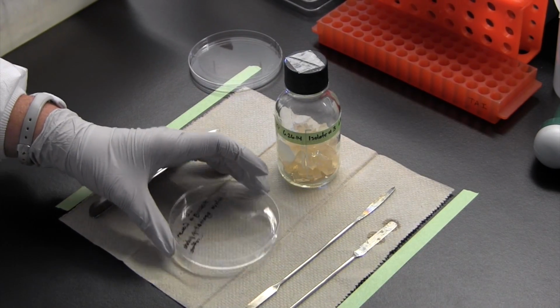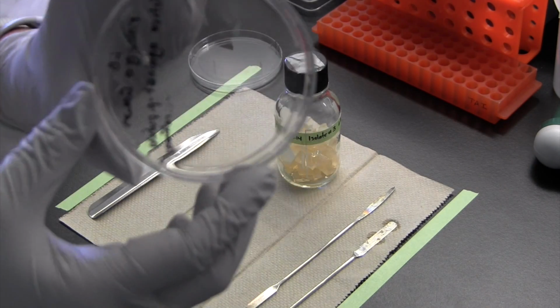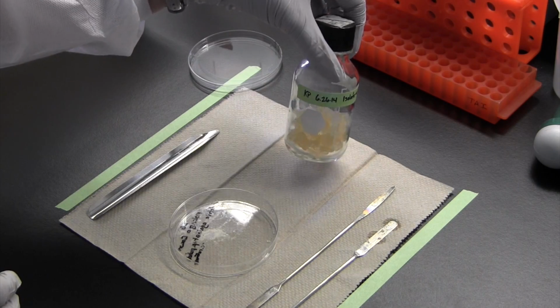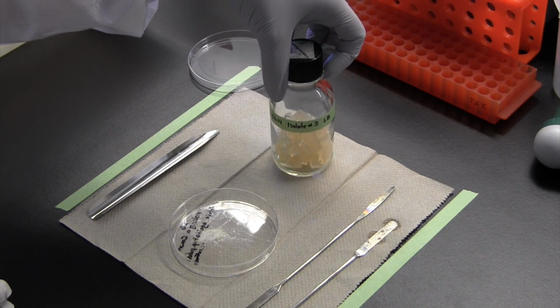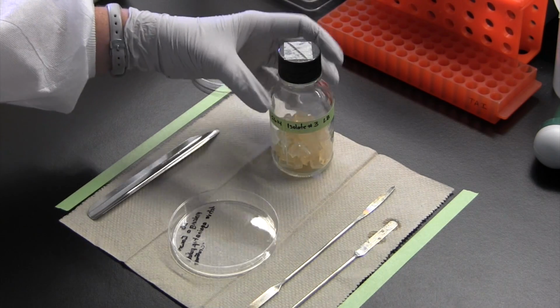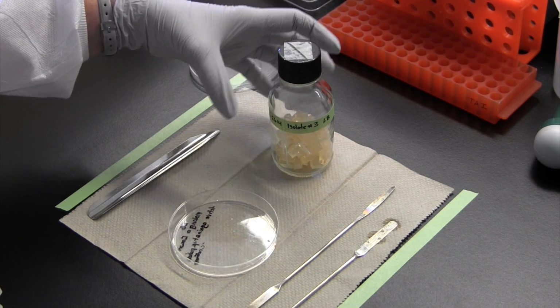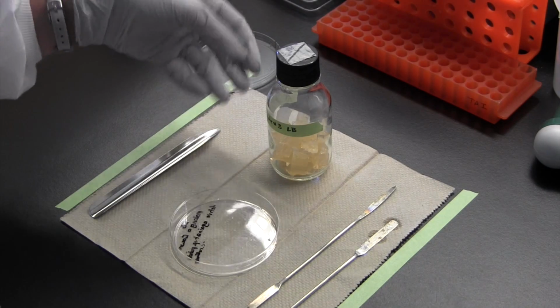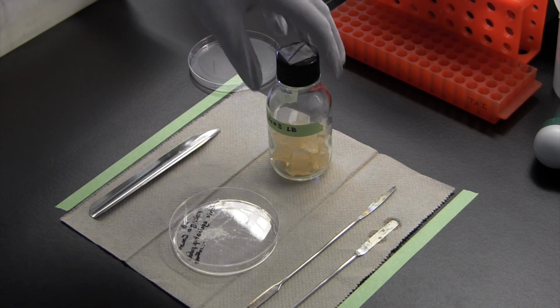Okay, so we've finished chopping up our agar, and you can see there's a nice empty petri dish. Nothing's left in the agar. The agar is sitting in this glass bottle. Just a couple of pointers. You want to make sure that when you're doing this, you use fairly small volume glass bottles, because the larger the bottle, the less effective it's going to be in terms of the ethyl acetate really getting in contact with all of the agar that you're putting in there.